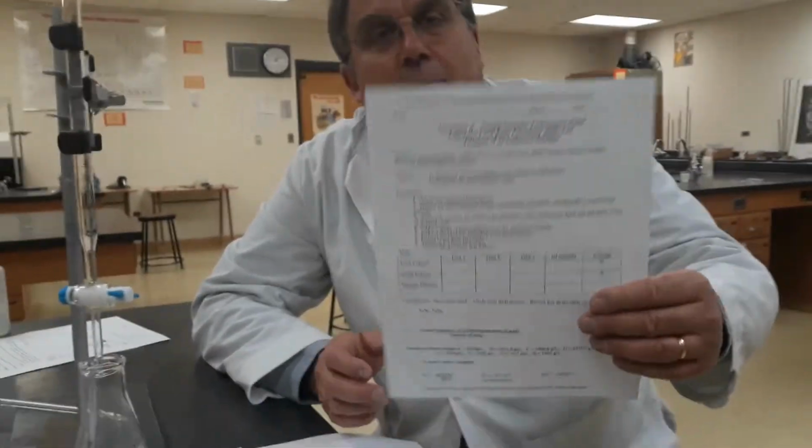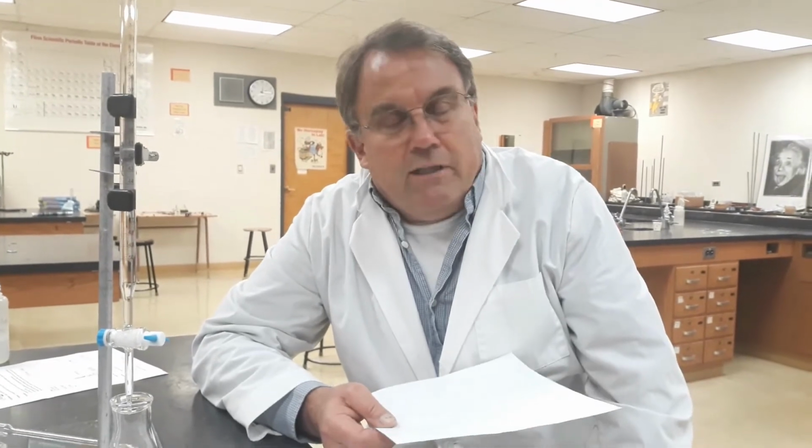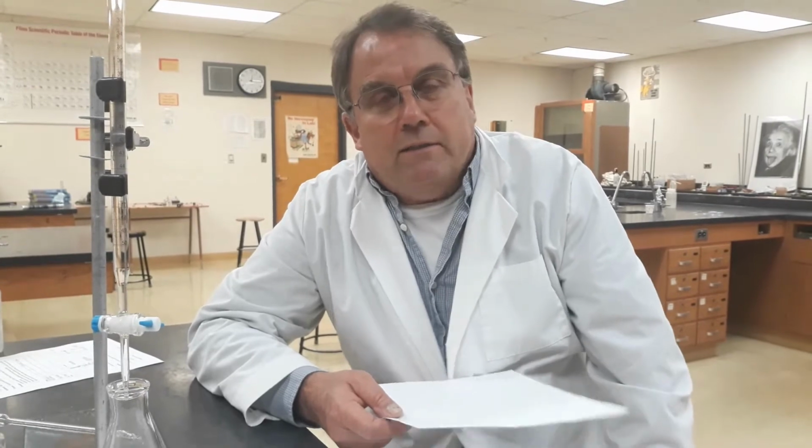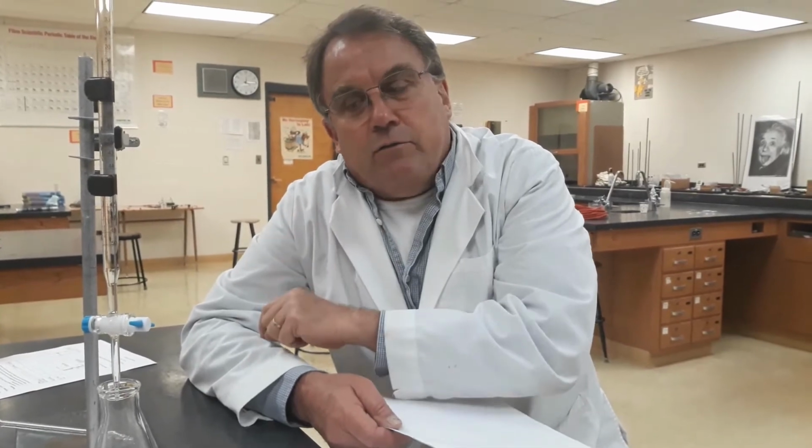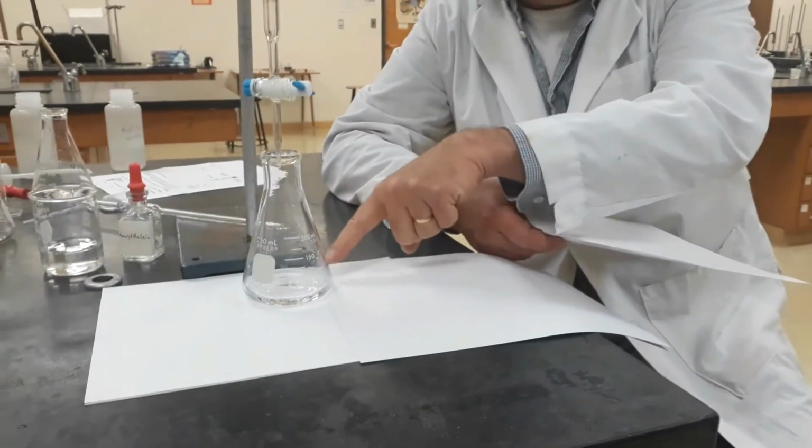It's going to go a little bit differently. I won't show you the calculations, but they work very similarly to the prior ones with one notable exception. That multiplier 2 at the front of the percent equation is not used because we want to know this concentration, not the original concentration. So the calculations won't include that multiplier.